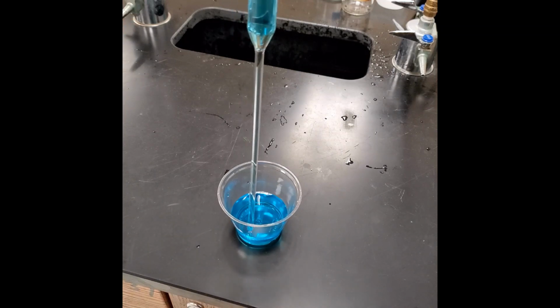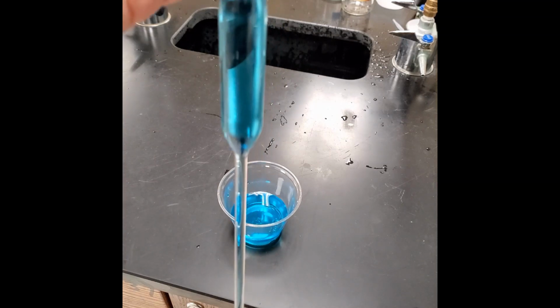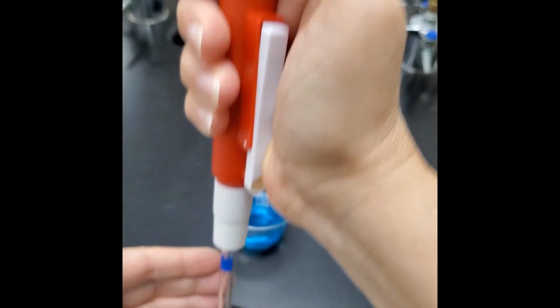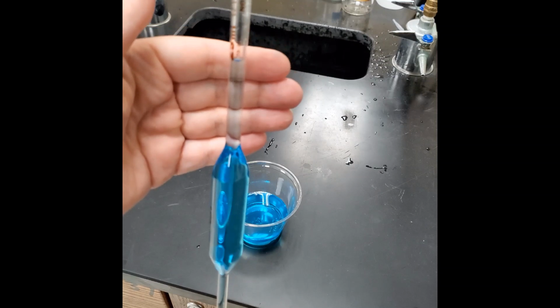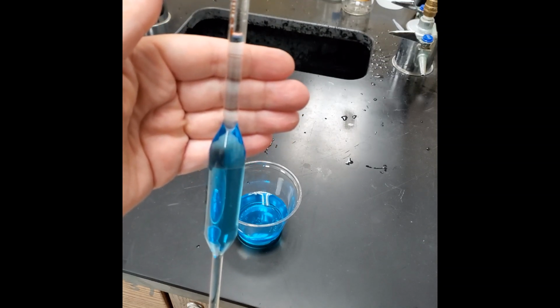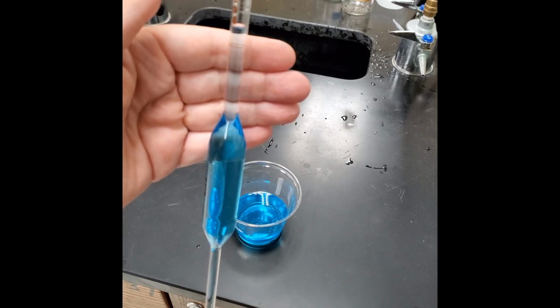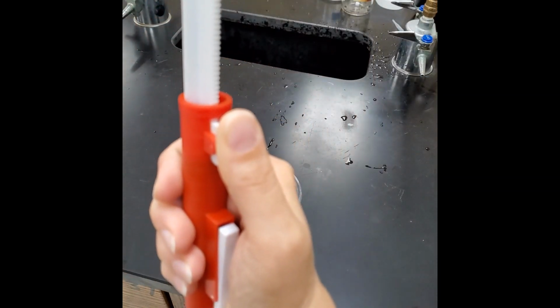Now once I get the liquid level above the line, see, this one doesn't have a good seal. Well, maybe a little bit. Okay, what I want to show you is, if I put my finger behind it, I still have the filler on here. Now, if this level stays, and I'm putting my hand behind it so it hopefully stays focused, then you can adjust the level of that using the dial without taking this off at all.